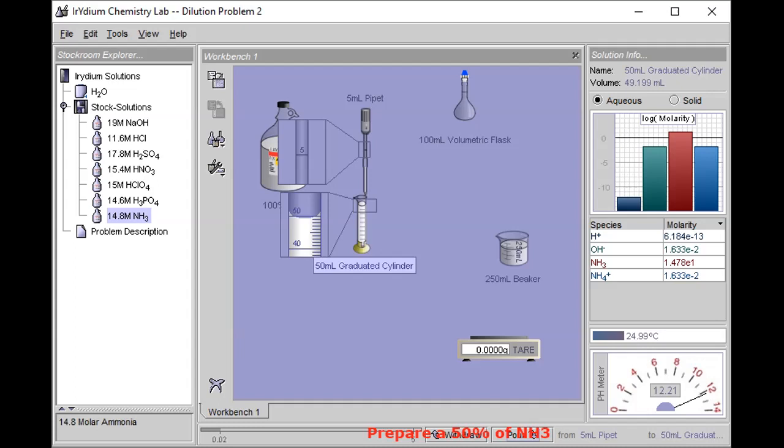So now what you want to do is, you're kind of nervous now, you don't want to go over 50. If you just click pour quickly, it adds like 0.02 milliliters at a time. So you just click and you see it's increasing. You just quickly press it. It does short bursts of solution.